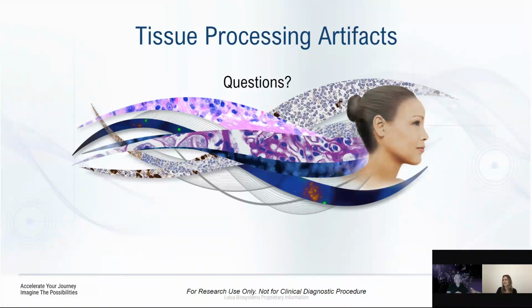Thank you, Robin. All right. Now, next question here, will overfixed specimens affect IHC staining?